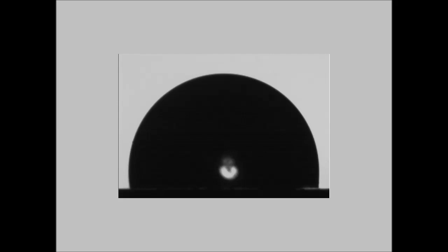This is the image of a molten drop of soda lime glass on a platinum foil. The calculation of the surface tension at 1100 degrees centigrade gave the value of 346 × 10^-3 newton per meter which is in good agreement with the bibliography.